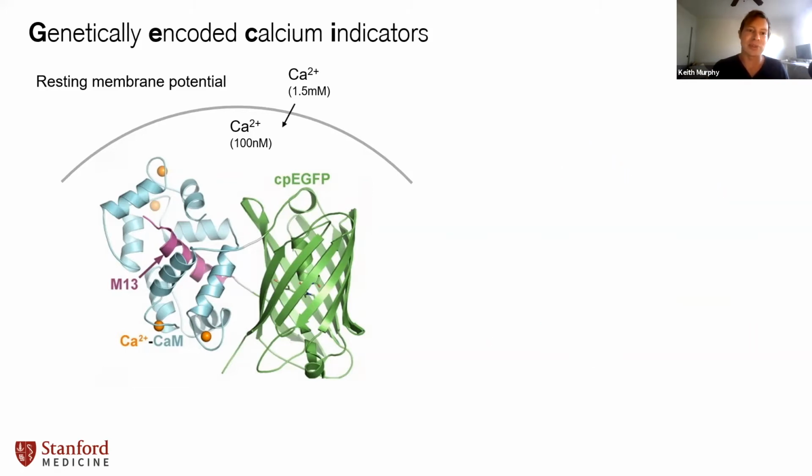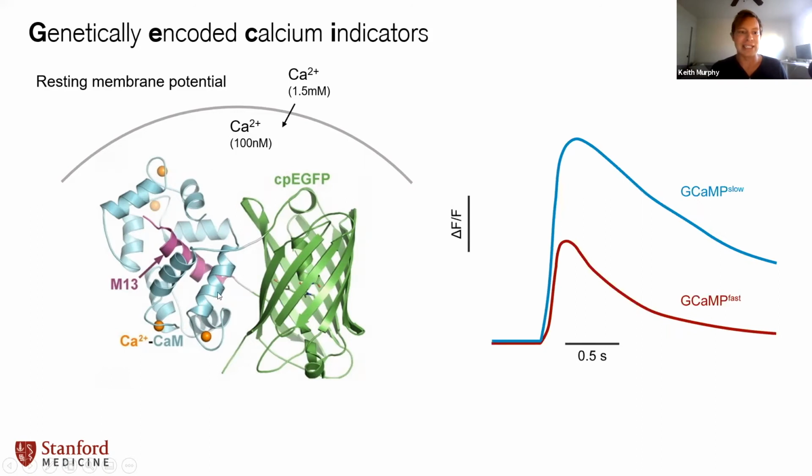And this causes a dramatic increase in this concentration, such that these fluorophores now become active. So you can imagine if I'm pulsing blue light into the system and I'm monitoring the green light that's coming back, when a cell becomes active, you'll see a large, fast rise in fluorescence returning. And that's telling us that calcium has changed the conformation of this molecule.